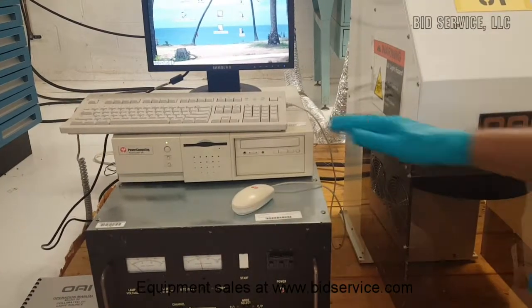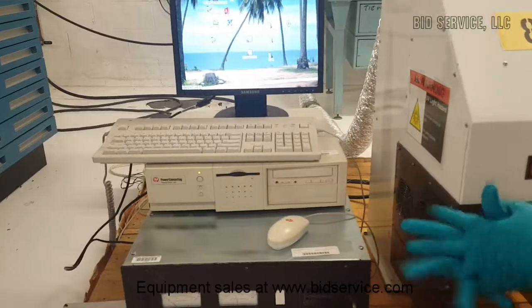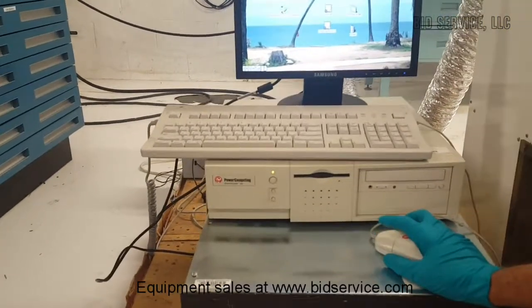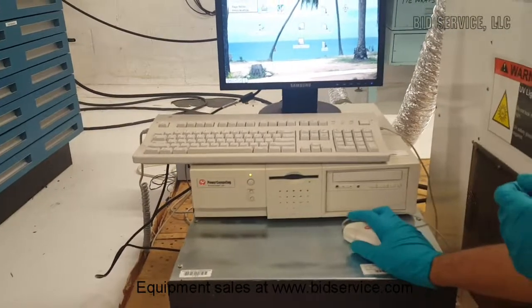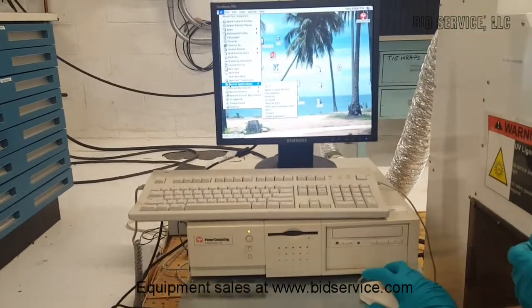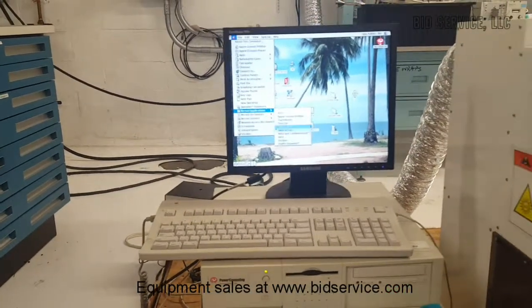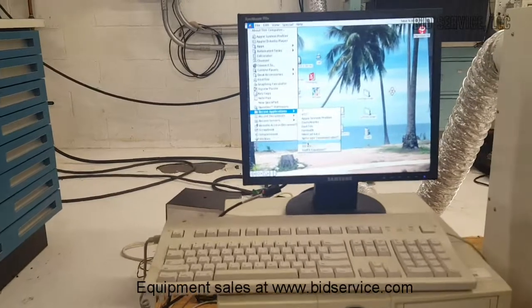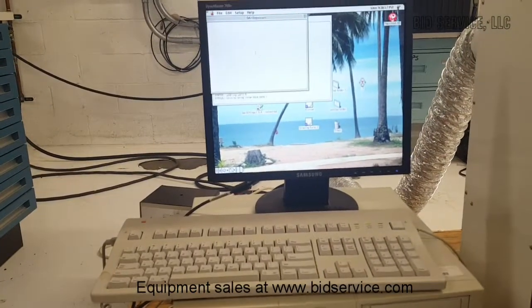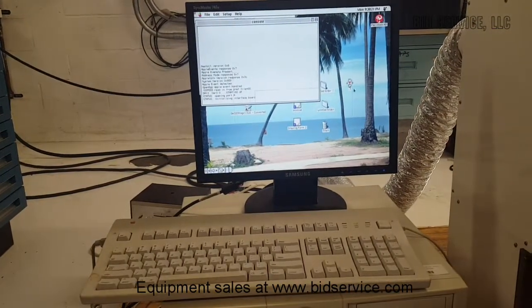Not many details exist with the computer, so I'm going to show how it works. There is an application which is listed in the recent applications, OAI 3. This application opens a couple of windows, the console and the OAI exposure window.